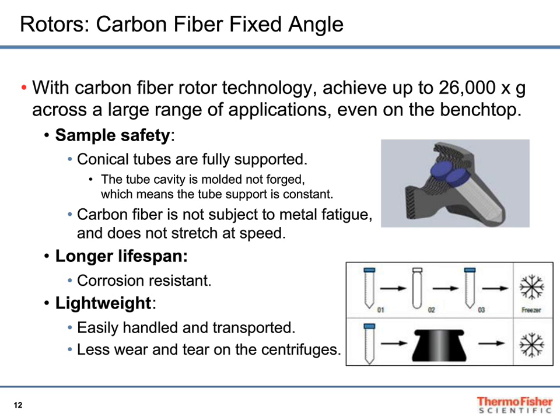So I would say these days the tendency is to move more and more towards refrigerated because we've been making them smaller, higher performance, and probably not as much cost differential as it was years ago. But again, a ventilated one is very much a viable option for cost, space, and if you don't need refrigeration. And it says here, for example, working with blood, which is all done at room temperature.